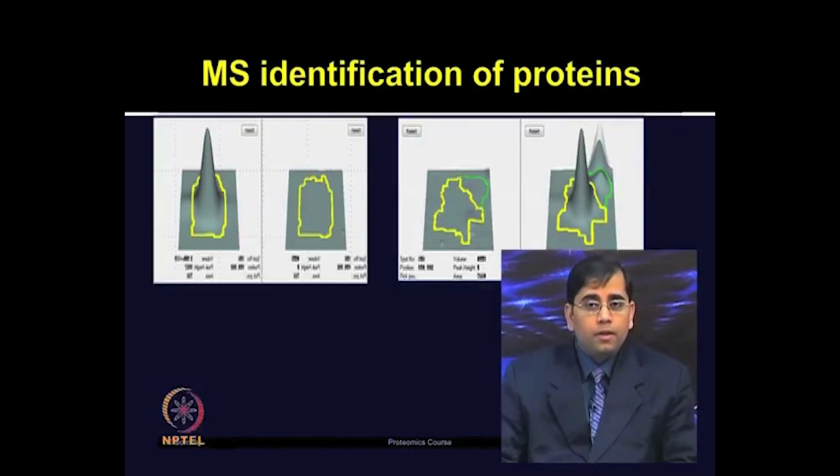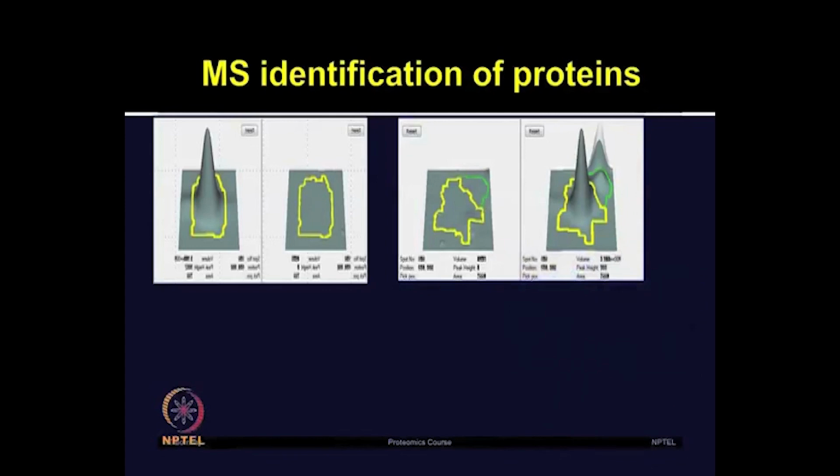They also found that there are 8 proteins which were overexpressed, and those included pigment epithelium derived factor, 2-HS glycoprotein, complement factor H related protein and leucine rich 2 glycoprotein. For the complete list of the proteins identified, you can refer to this manuscript. These are some of the interesting proteins which the authors identified.